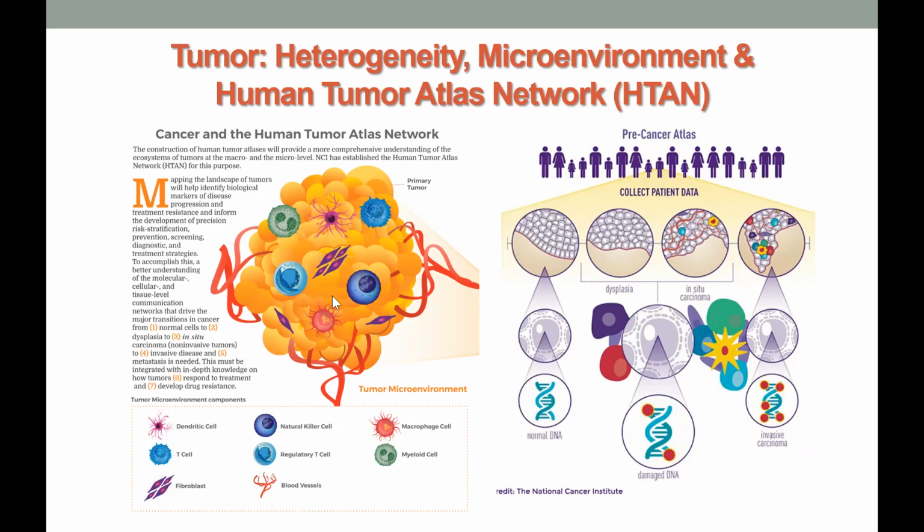And while the traditional methods use either single-cell sequencing or single-color imaging to try to pinpoint this complex behavior, in the past 10 years we have started to have the power to measure multiple markers at the same time. That allows us, first, to identify the cell types within a given environment. And second, to try to understand the differences between diseases, especially the progression of disease, as well as the individual differences in different patients.